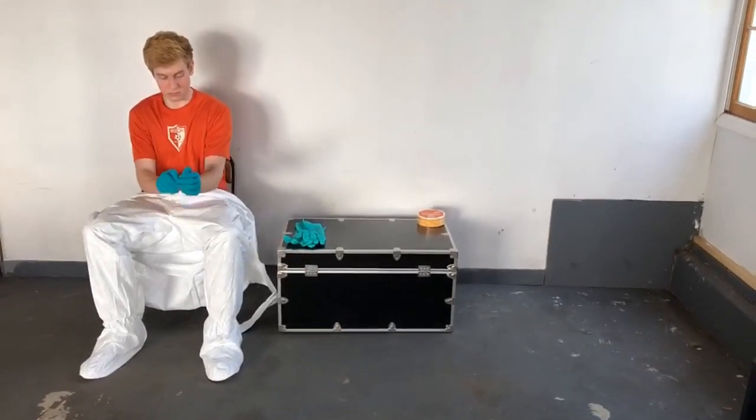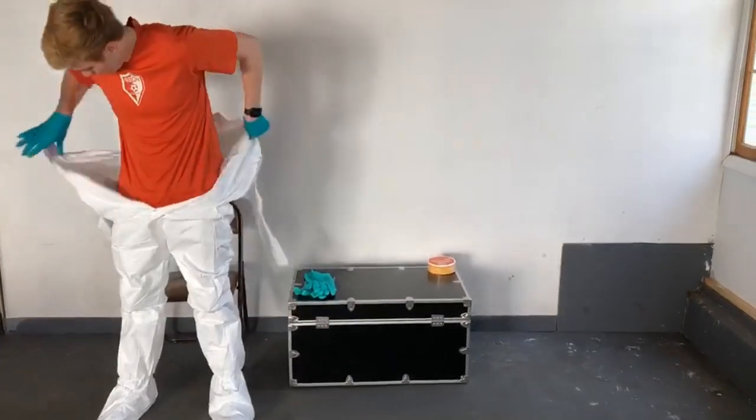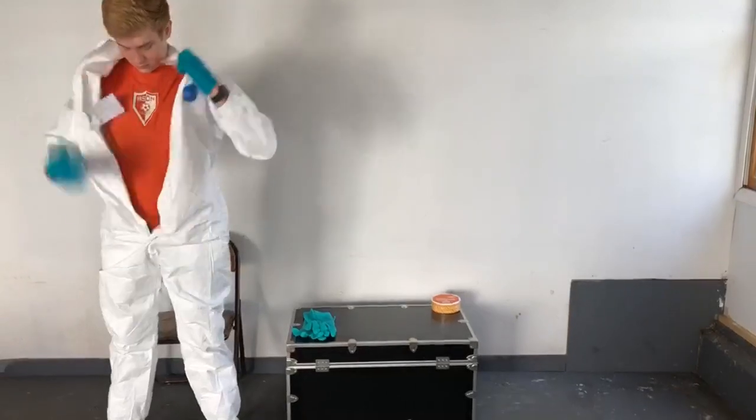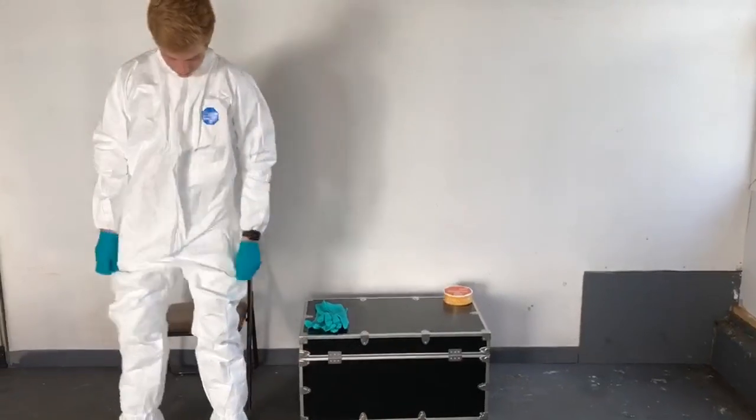Now Matt can stand up. He's going to bring the garment up over his shoulders and zip it up.